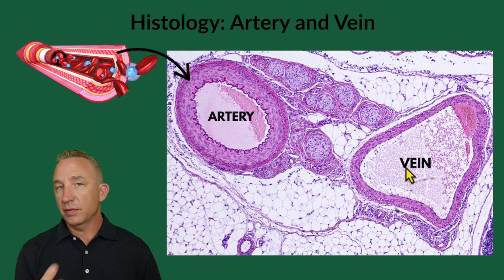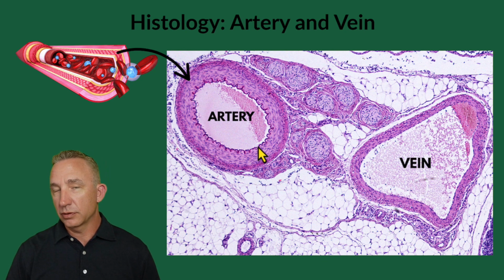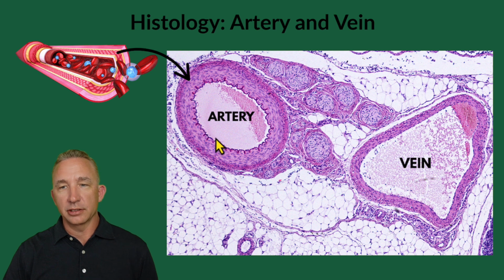And then we have three layers of each. Where I have the blood touching, this first layer is called tunica interna or tunica intima. Remember, tunic or tunica is referring to a layer. And it's just this small little ribbon here. So this small little dark ribbon that you see is tunica intima. It's intimate with the blood. Or tunica interna. So you'll see either term, intima or interna.